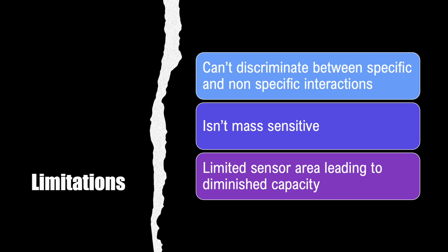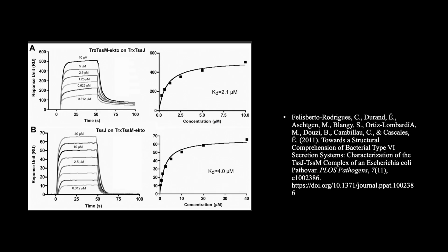So you would need to either increase the sensor surface or do several runs to lessen the limitation. So now I'm going to go over 3 different papers that utilized SPR in their research methods.